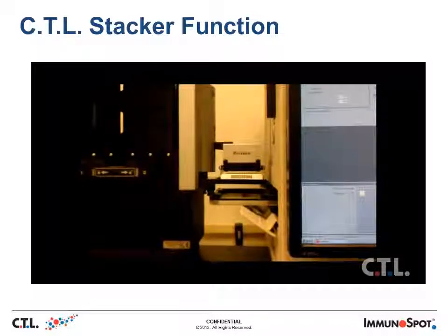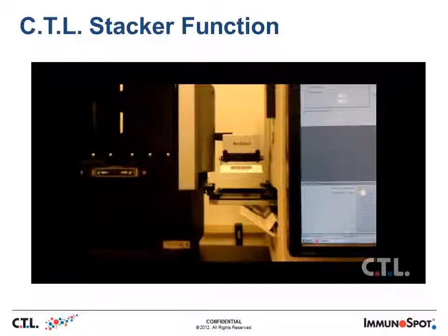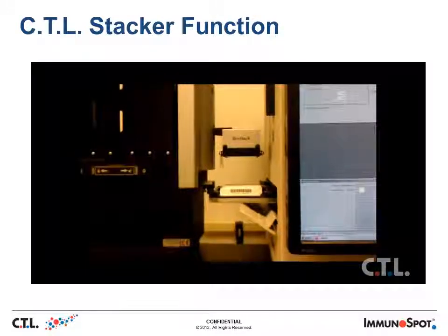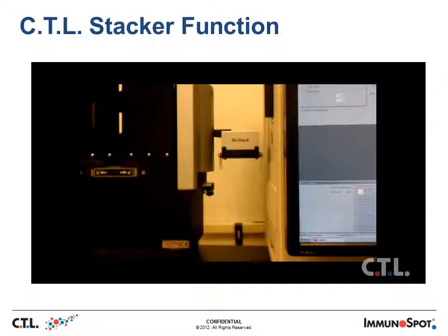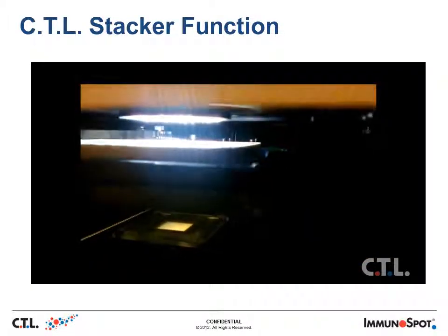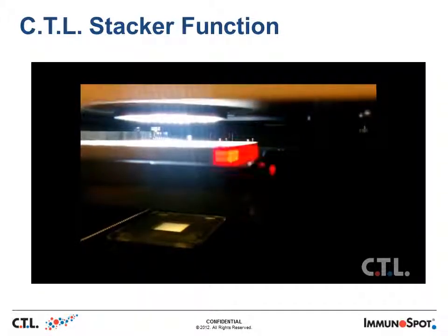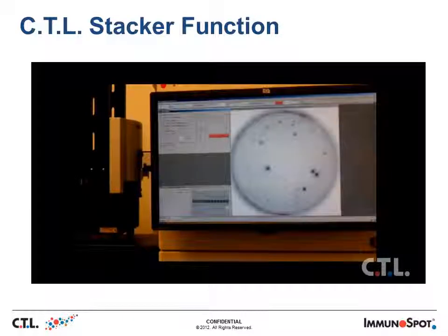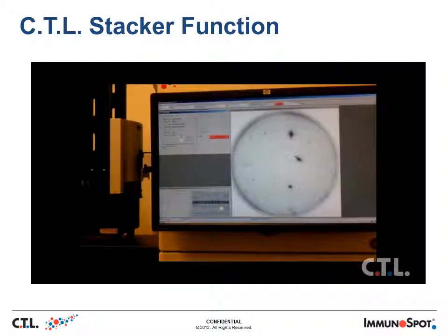The stacker finds the first plate and loads it onto the plate loading region of the analyzer. The plate is inserted and positioned within. And the wells are scanned and counted in real time. What we are seeing here is a colony assessment assay.